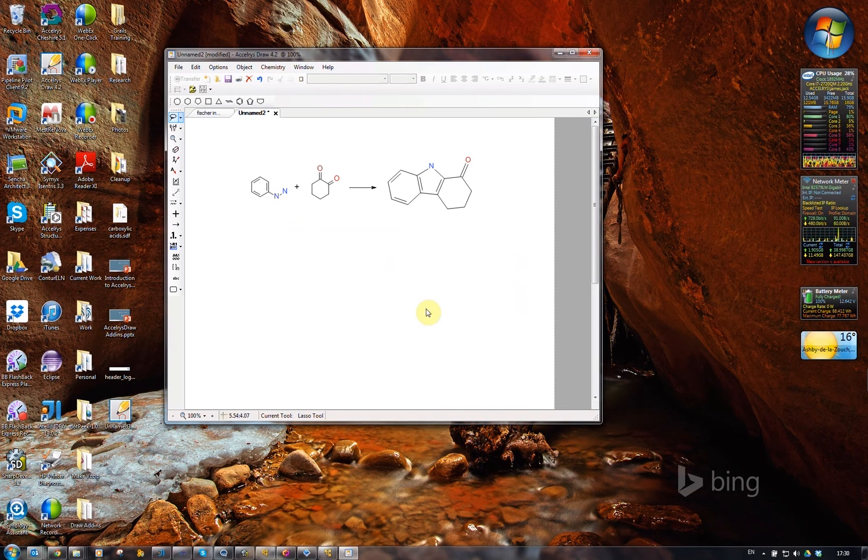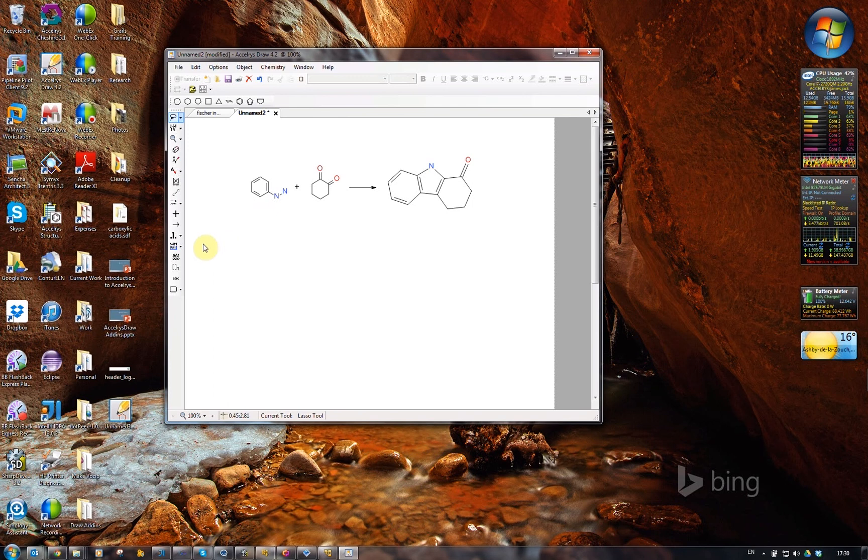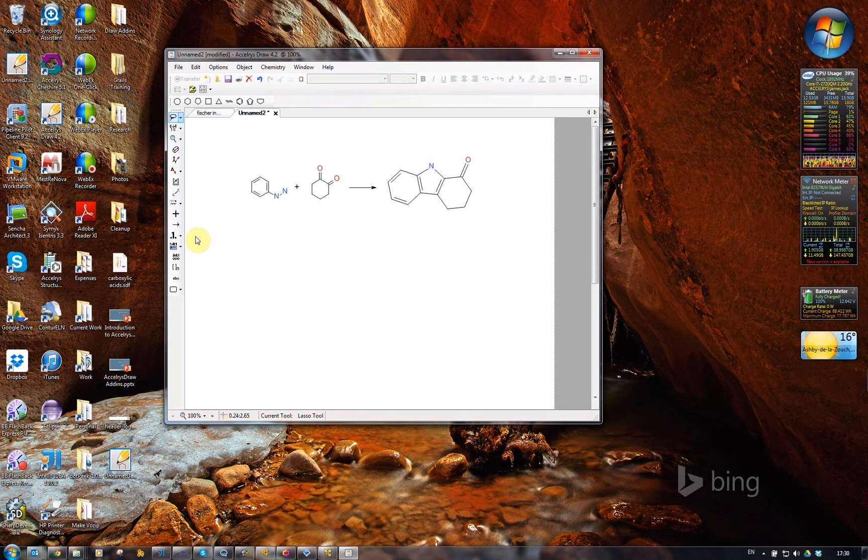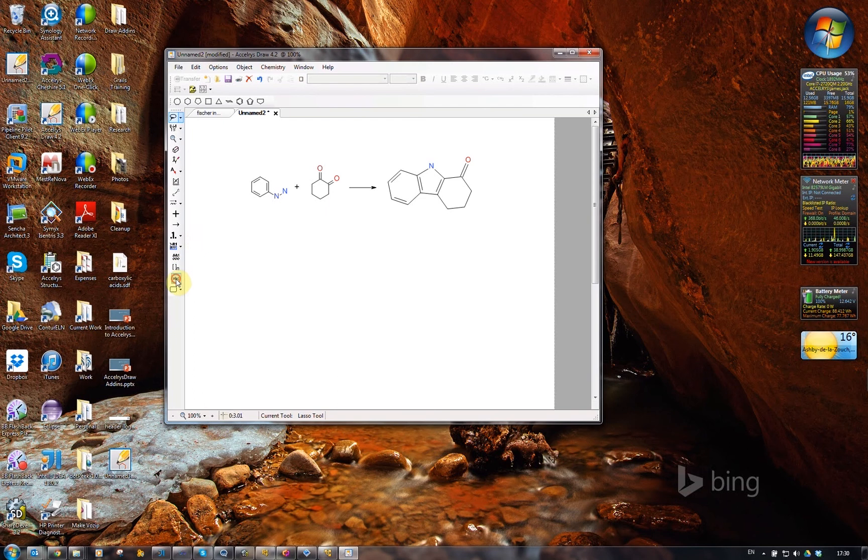For the last piece of this, which is the stoichiometry calculator, I need to add some text here above the reaction arrow.